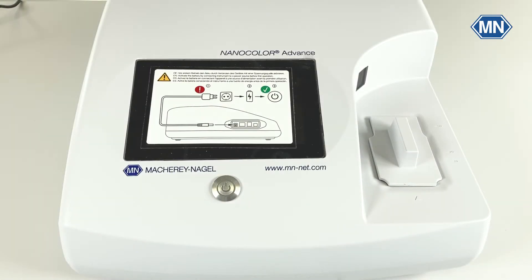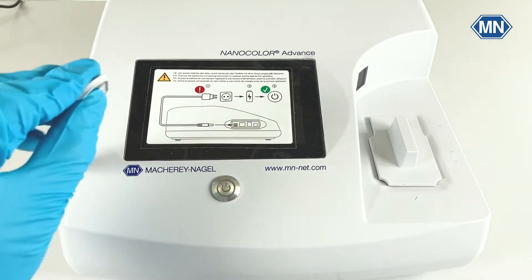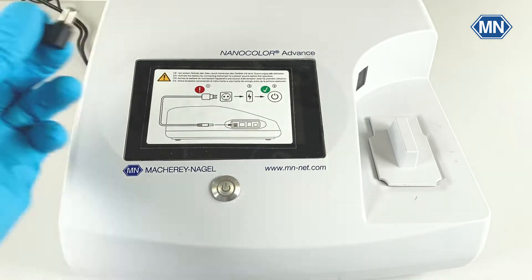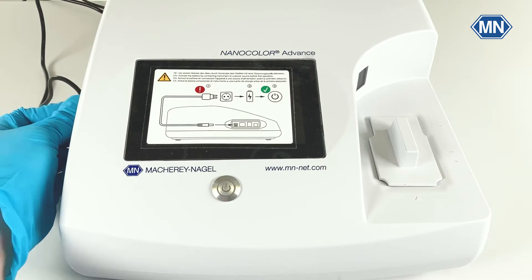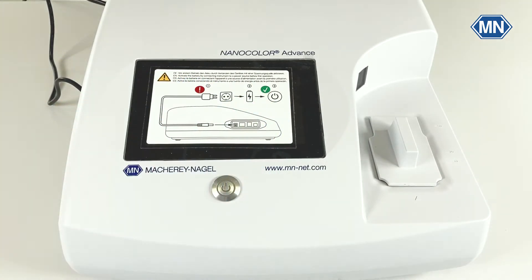Before you can work with the photometer, it's necessary to charge the battery, which also disables the transport safety mechanism. To do so, remove this magnetic cover and plug in the power supply into the photometer. This is also described in detail on this sticker here on the display.